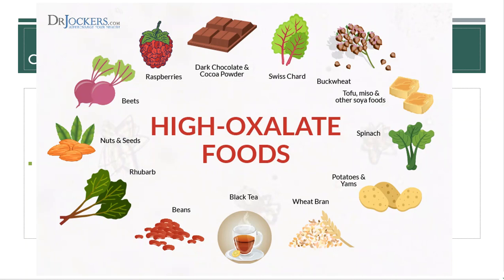But this is just one part of the puzzle, right? Sodas and phosphates can do that as well, but glyphosate is a phosphate-related compound, right? You can kind of see it in the name. So, that's why we're doing the lab.